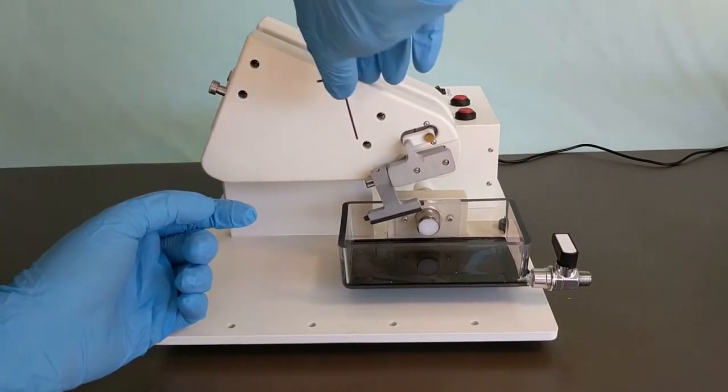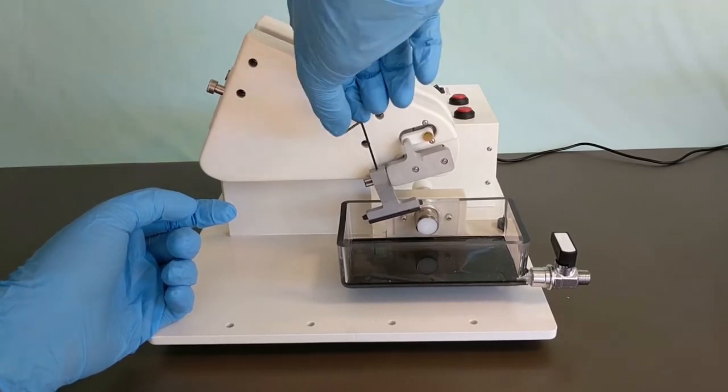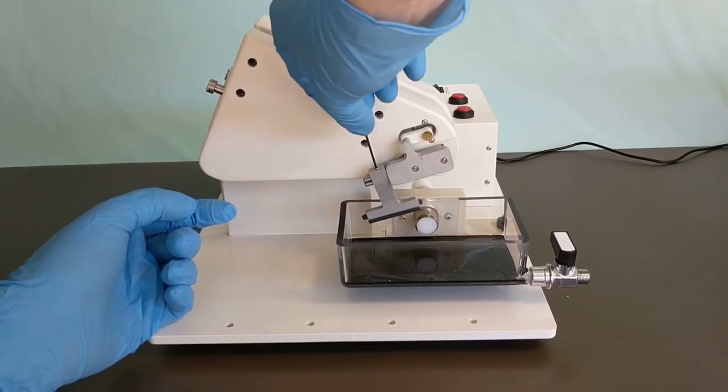To remove the blade holder, first unscrew it using the small allen wrench again and then carefully slide it off of the machine.